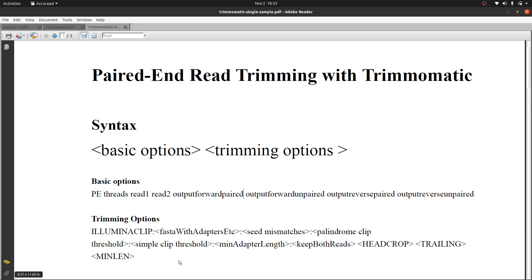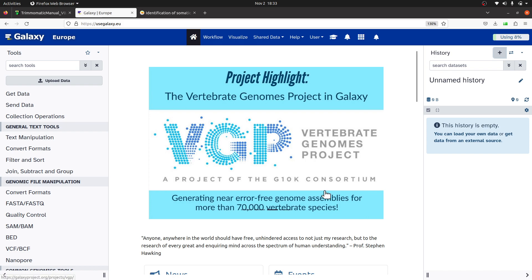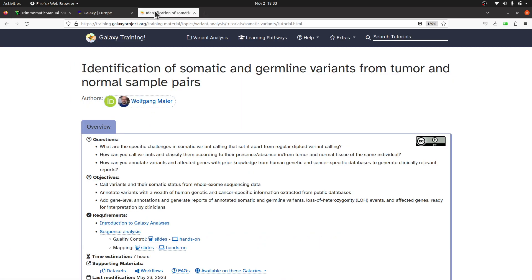In Galaxy you don't need to type all these codes — everything will be done for you behind the scenes. But I thought I'd let you know how it works, because you need to understand these tools so that if you want to write your report or do a brief explanation you can do that. So let's move back to the Galaxy platform and start the exercise. I'll show you where to get example data.